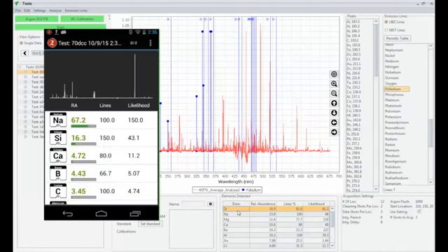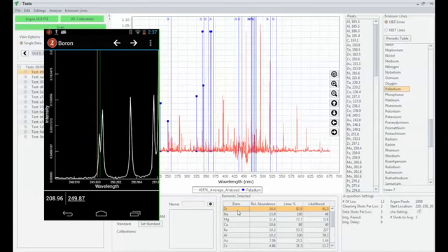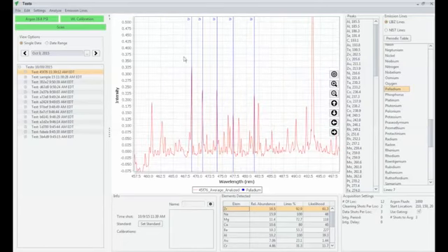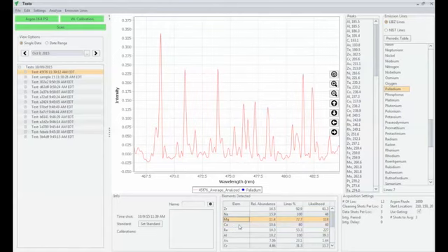This works a lot like our companion software Element Pro, which is actually run on the instrument in the Android operating system. But here we can see detected zirconium, so we can click on zirconium. It'll quickly show us all the zirconium peaks, and we can go and confirm, all right, there we go. Those are our zirconium peaks. We see 5 in a row, and that's a great way to confirm that zirconium actually is in our sample. We have magnesium, calcium, barium, two different ways to approach analyzing a spectrum.